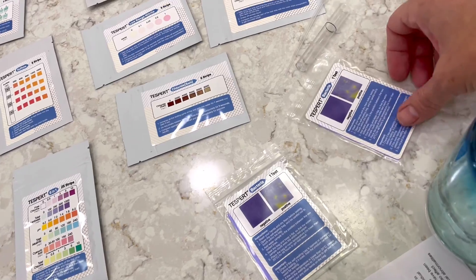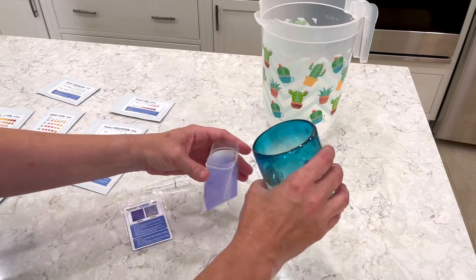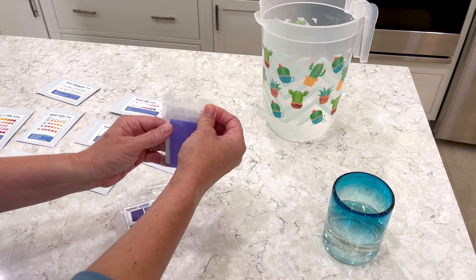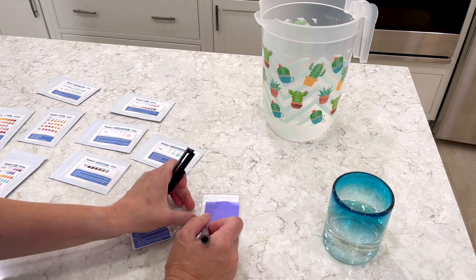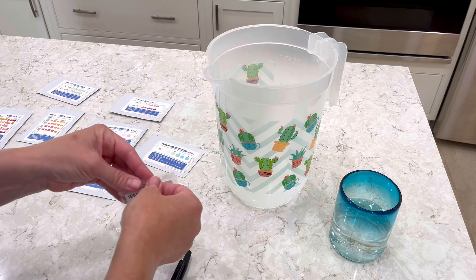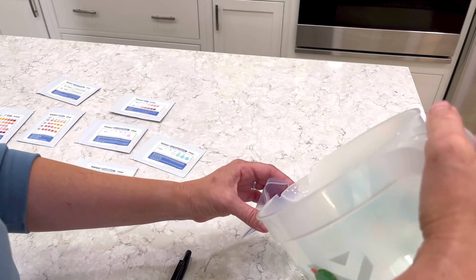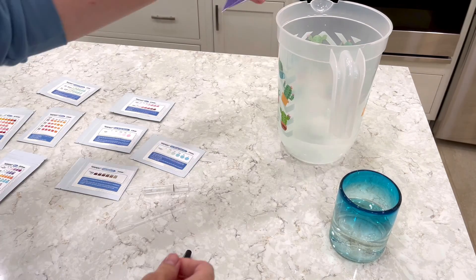This testing kit is really easy to use, but the bacteria test takes two days — 48 full hours for the bacteria to develop. So I'm going to run the test on the water today, and then after two days I'll show you the results, and then we'll do the taste testing. I'm marking this kit so I remember it's my well water, not the emergency water storage. The next bag is going to be the emergency water storage. You only need a little bit of water for this kit — I keep overpouring, but that's all right. You can always pour a little bit out to get it to the level you need.